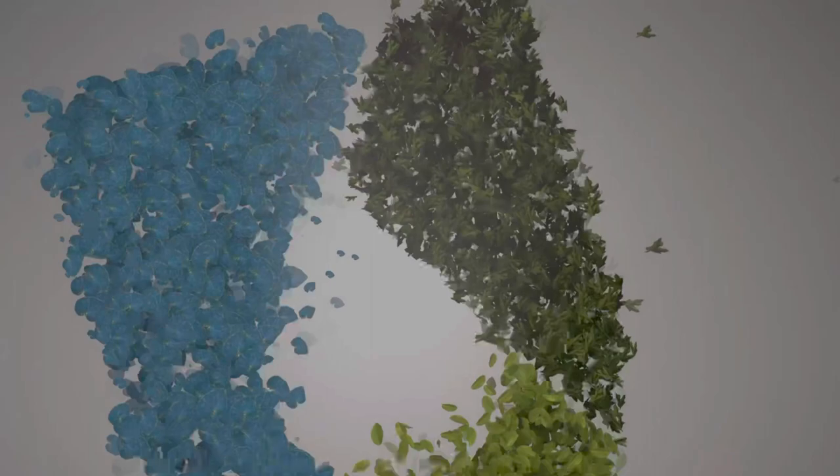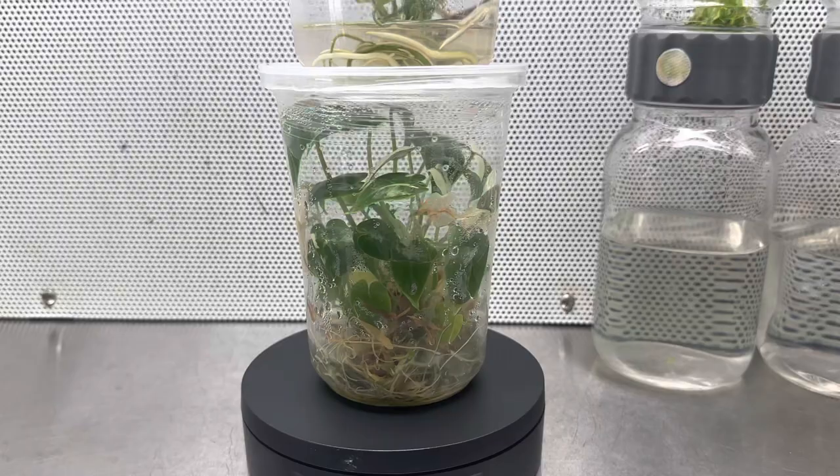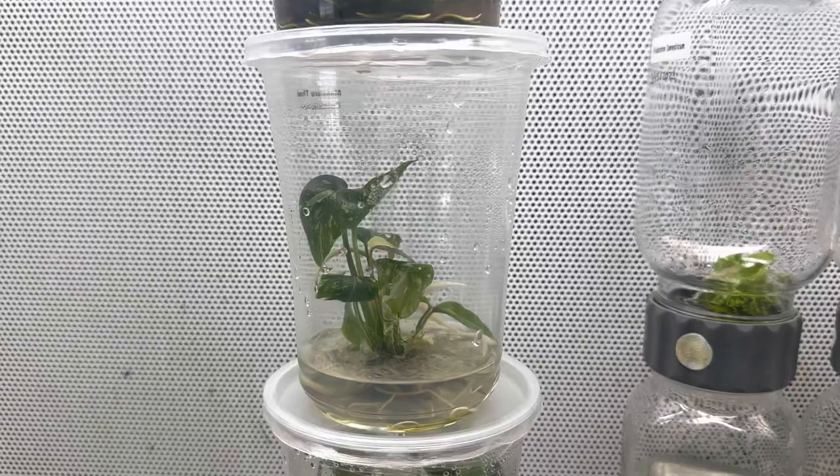This is the best tissue culture media to grow houseplants in tissue culture. I know a lot of you guys follow the same tissue culture media recipe I use on my houseplants, however, I have changed it.